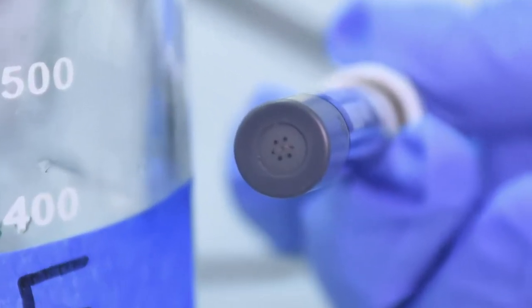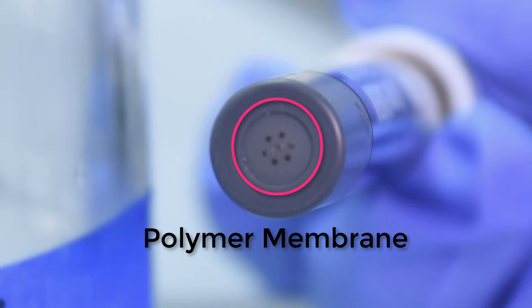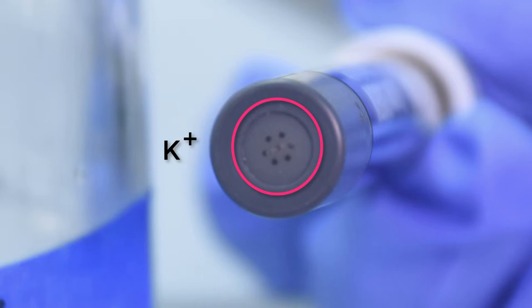The polymer membrane selects for the activity of one ion over another. For example, the electrode we will be using has a membrane selective for potassium ions.